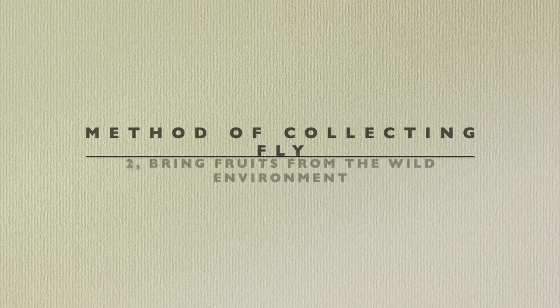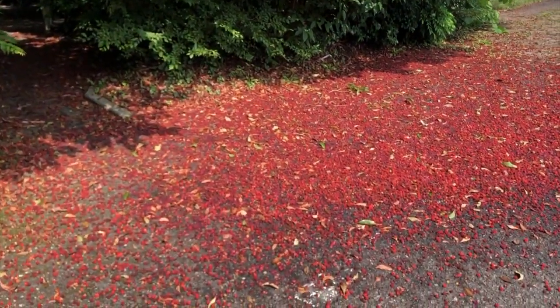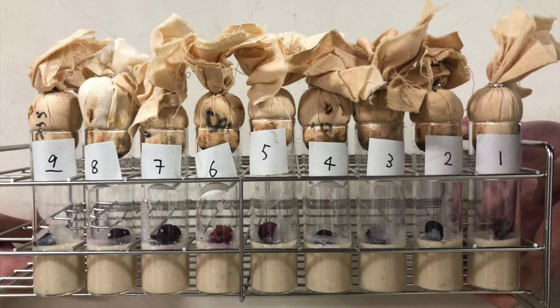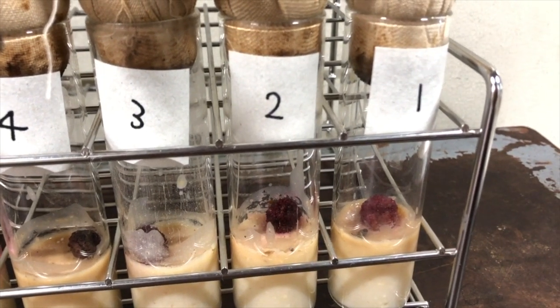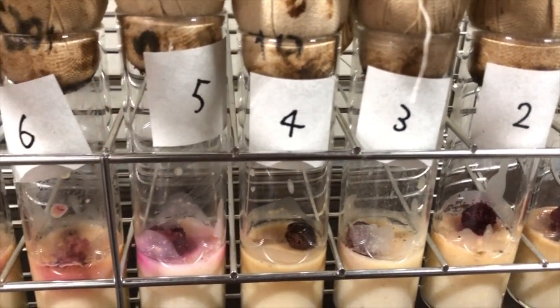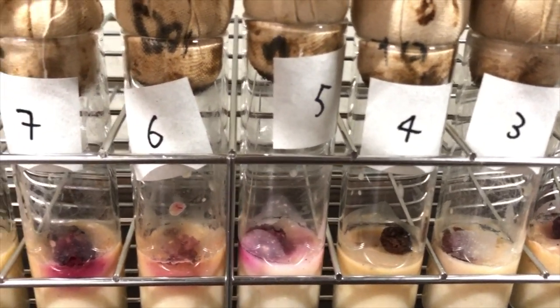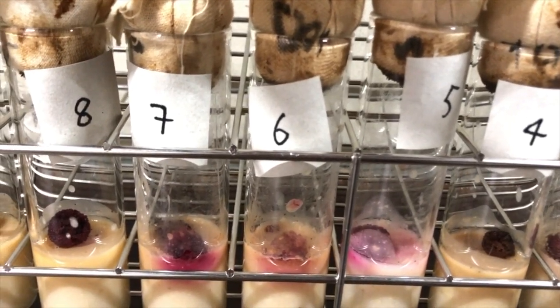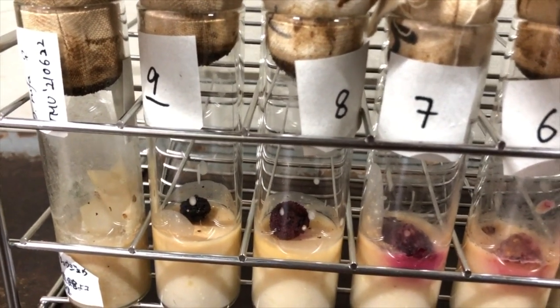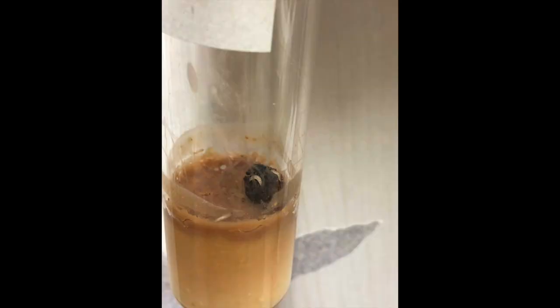The next method is bringing fruits from the wild environment. Collect overripe fruits from the ground under the Yamamomo tree. Put each fruit in a separate food vial and mark it with numbers one to nine. In one food vial, larvae appeared.